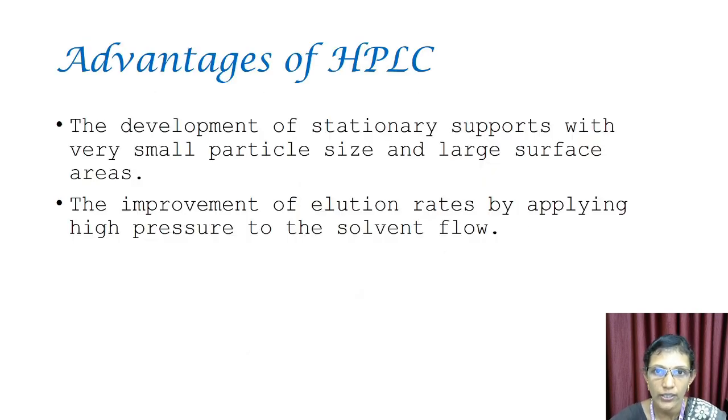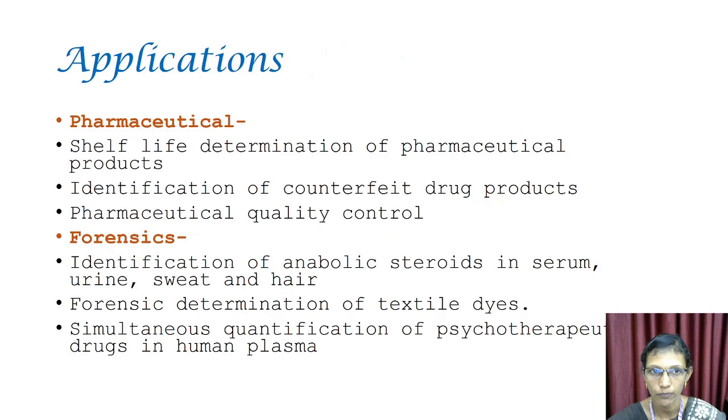What are the advantages of HPLC? Here there is the development of stationary supports with very small particle size and large surface areas. The improvement in elution rates comes from applying high pressure to the solvent flow.